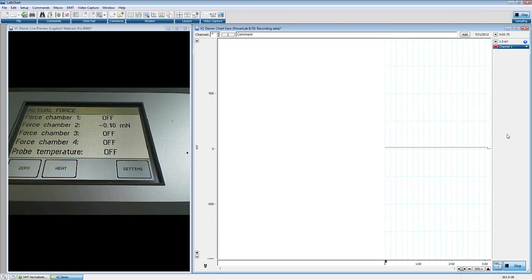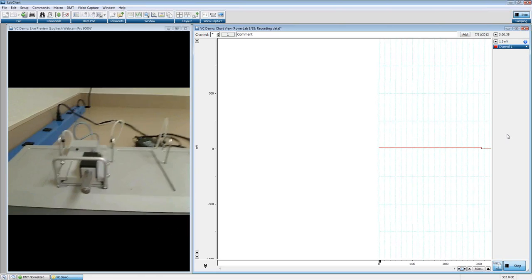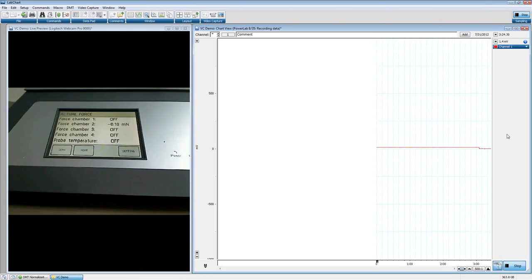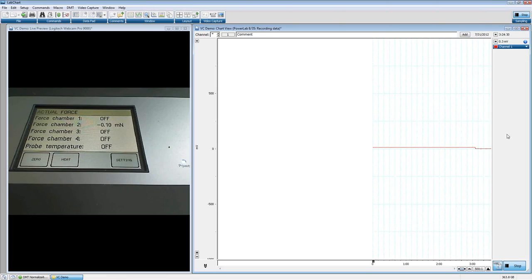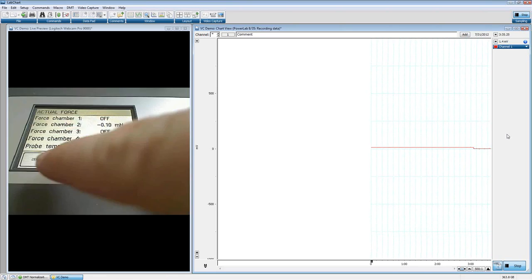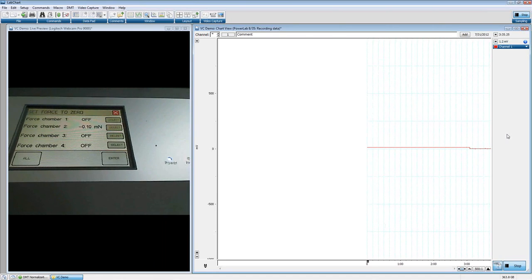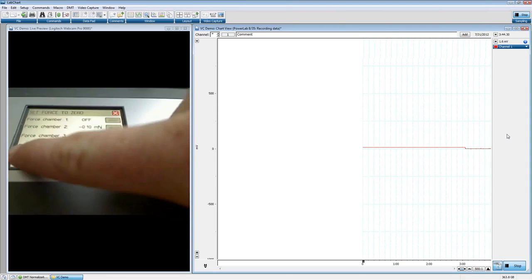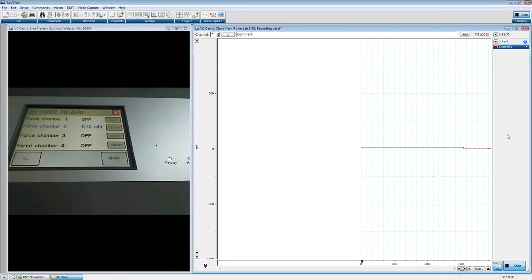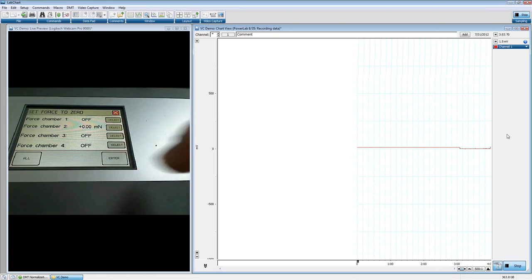Now we're going to calibrate our data. First, I'll show you how to zero it. Right now I have nothing touching my chamber — that's the ideal situation to perform this zero. You can do that by clicking the Zero button, then selecting the chamber you want to zero by clicking Select, or clicking All to zero all chambers. I only have one connected, so I'll be zeroing just that one. Hit Enter and we should be able to zero that chamber.